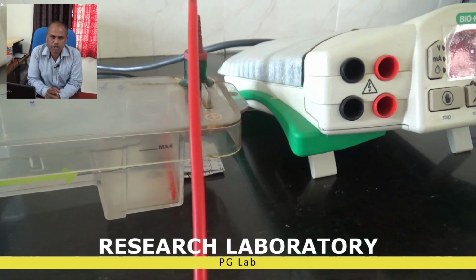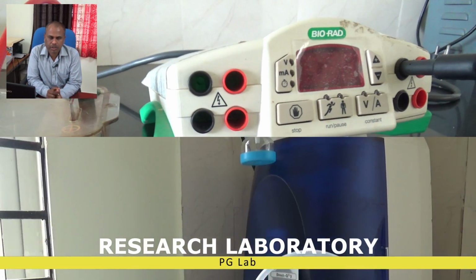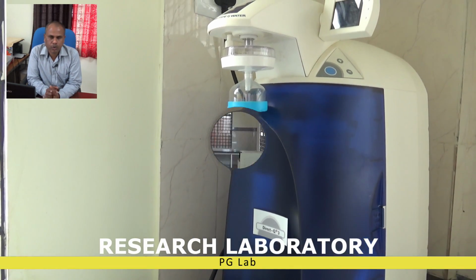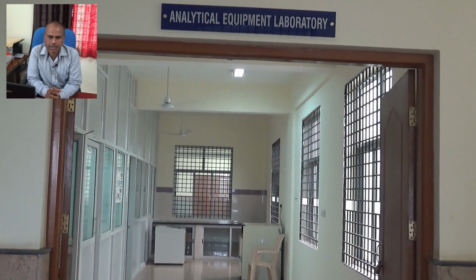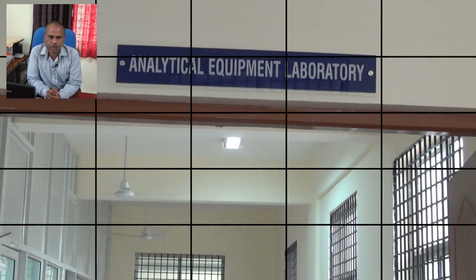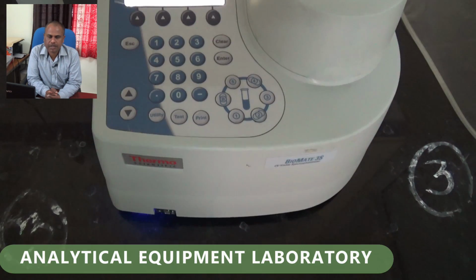And we have instrumentation facilities in the different labs, distributed in both the UG as well as the PG labs, and we have 2 UG labs, one for veterinary physiology and another for veterinary biochemistry. And for the PG lab we have different instrumentation, and those facilities are available to the different departments of Veterinary College Shivamogga.